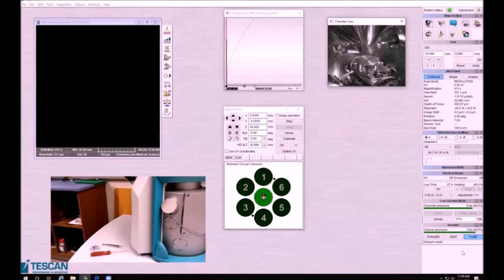You are going to start by coming over to the vacuum window and venting the system. Once you click vent, you will hear the instrument begin to vent — this is nothing to be alarmed by. It may take a few moments for the system to vent. Once the vacuum window has indicated that venting is finished, we can now open the door and load our sample.